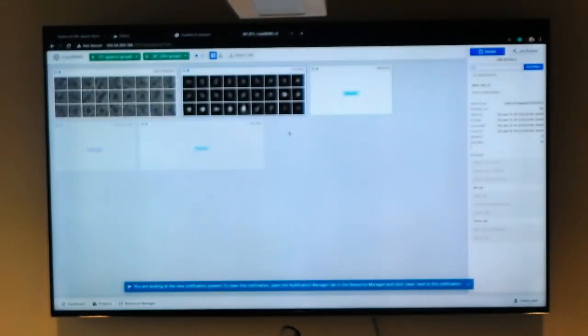But it's already amazing. You can see the level of detail. A lot of people like to see the secondary structure detail in the class averages to help them with the criteria of whether this is a good reconstruction or not. Another advantage of the web interface is you can download certain of the outputs. This will become more useful, and is why we ask you to also install Chimera, because you'll also be able to download models.